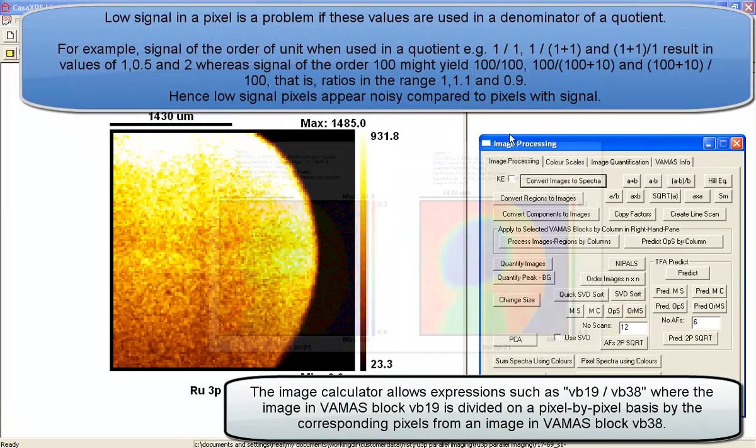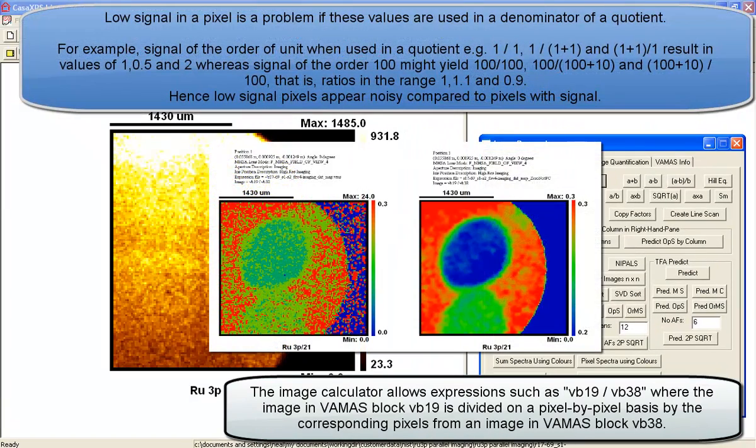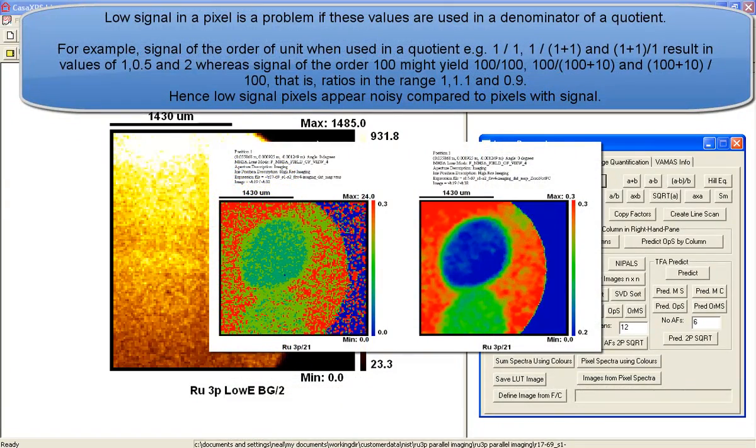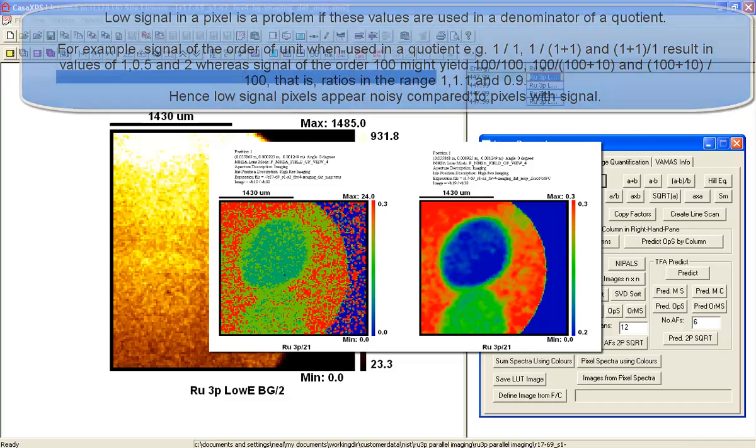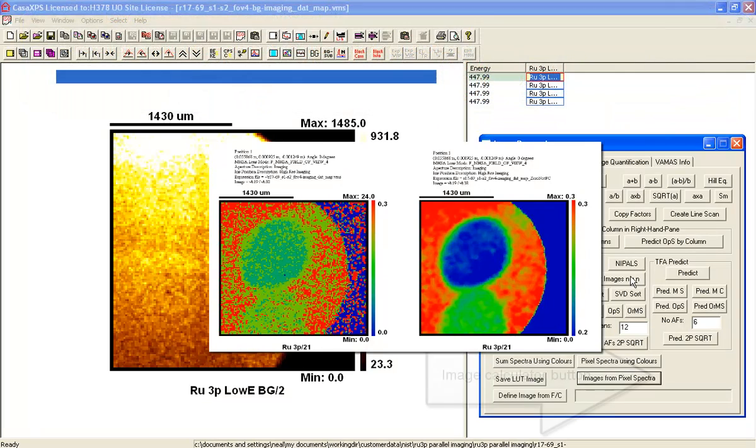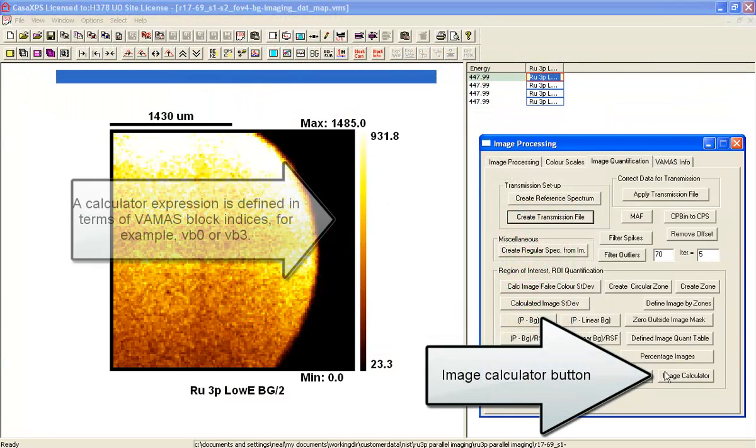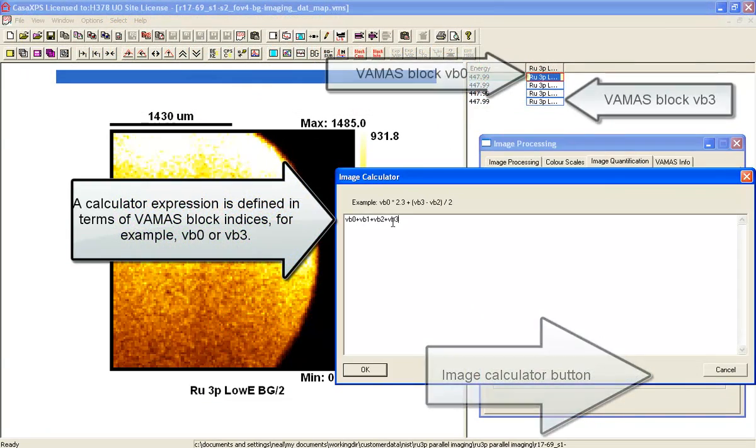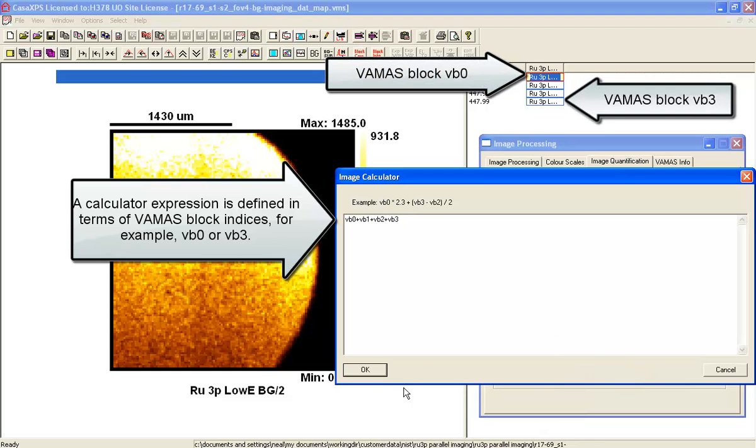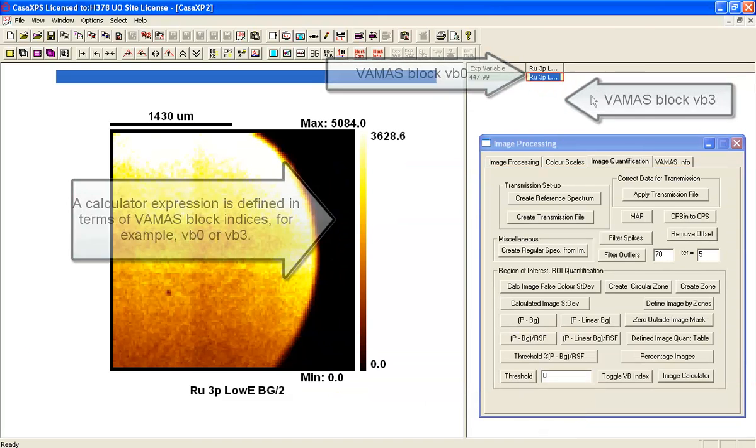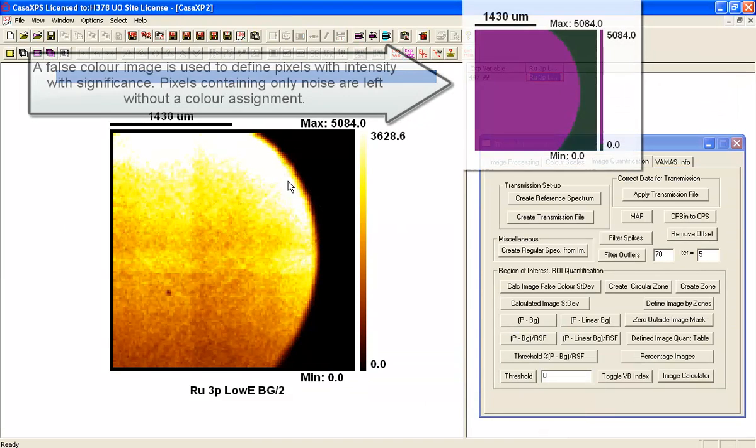So to avoid dividing by very small numbers relative to the signal, what we are going to do is create a summed image of these images in order to get a better signal to noise.